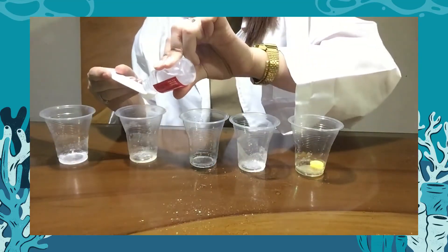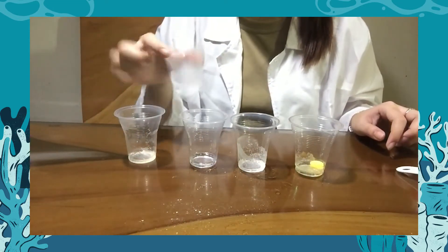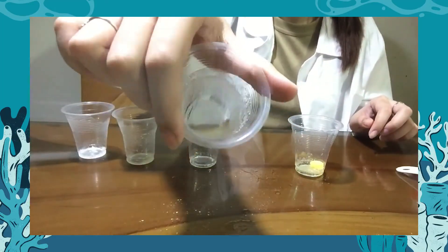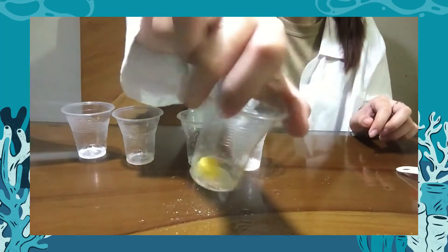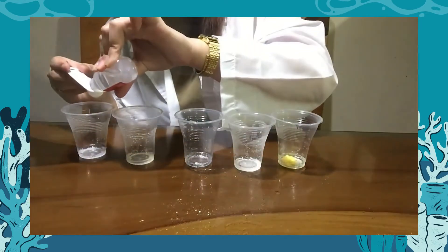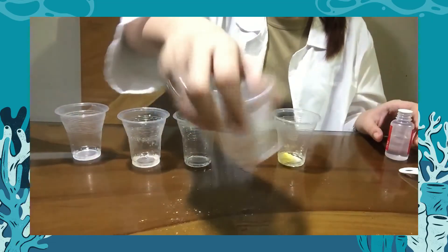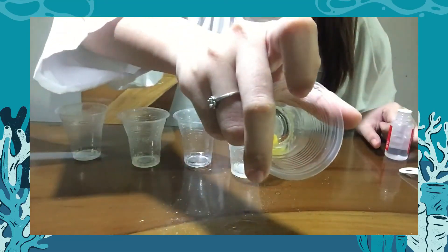We added another milliliter of acetone to the sodium chloride, sugar, gelatin powder, and margarine cups and shook again. None of them dissolved. After a third addition, they still did not dissolve. While doing this, the plastic cup became colder because of the acetone.